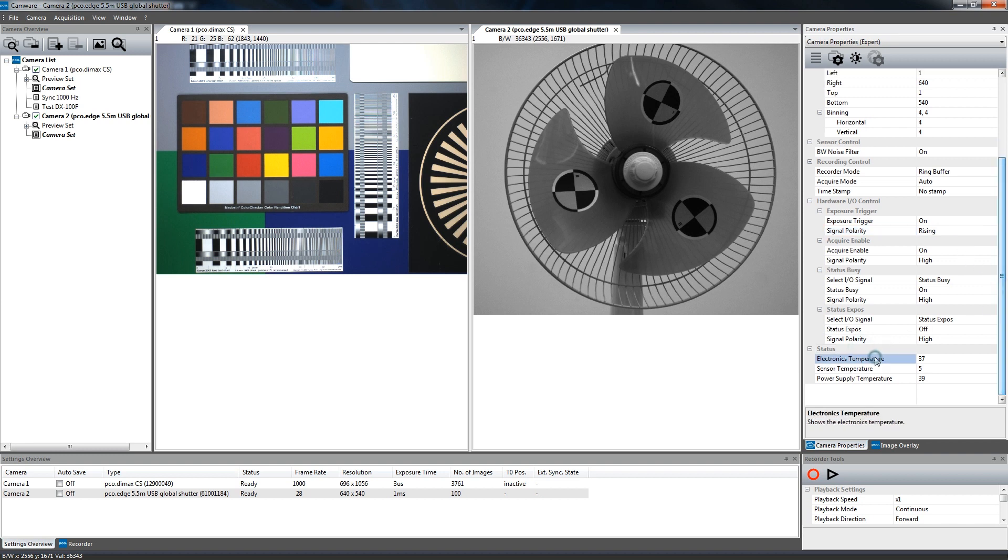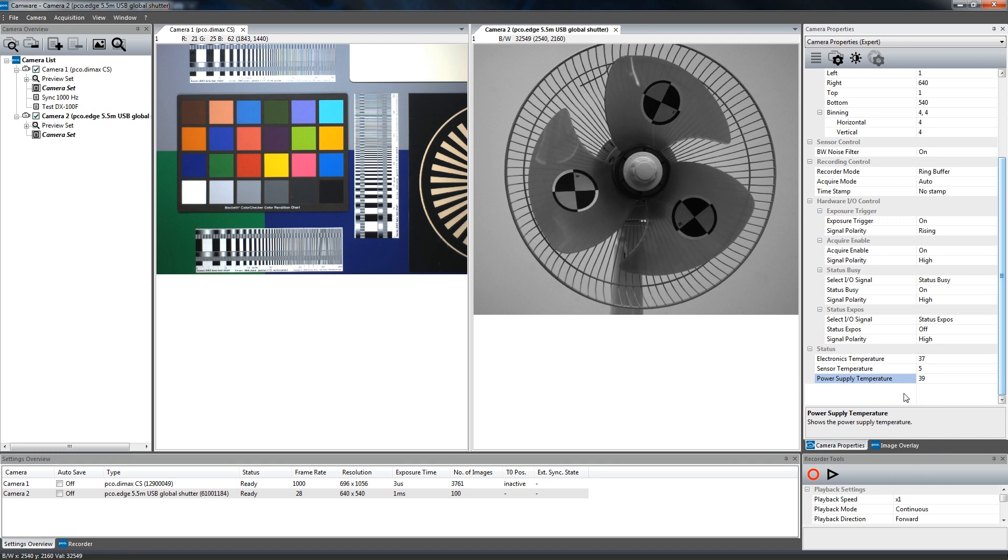The status section shows the current temperature level of the camera system. A dialog box at the bottom of the properties menu shows different descriptions for each setting of the camera properties. In addition to that, a closer look into the camera manual will also help you to understand the functions in detail.